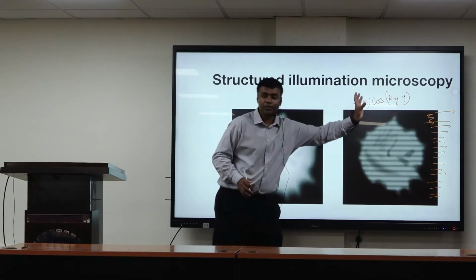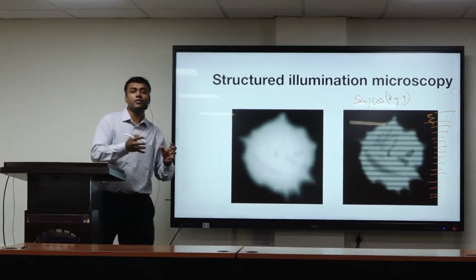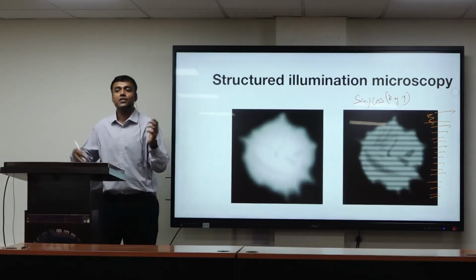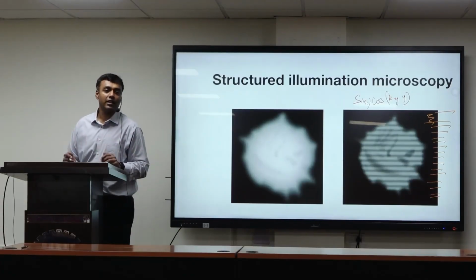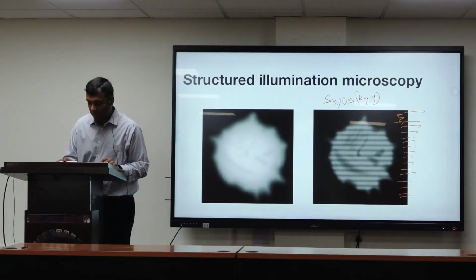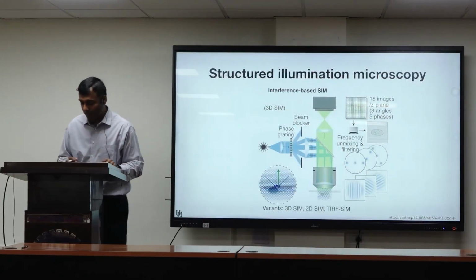That way you shift the frequencies and then make a measurement, shift in a different direction, make a measurement, shift in different directions, make measurements. And that's the essential idea of this structured illumination method. So let me elaborate on this a little bit. Let me actually get to this picture.